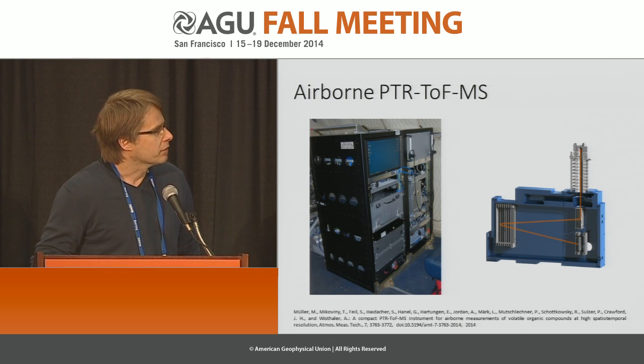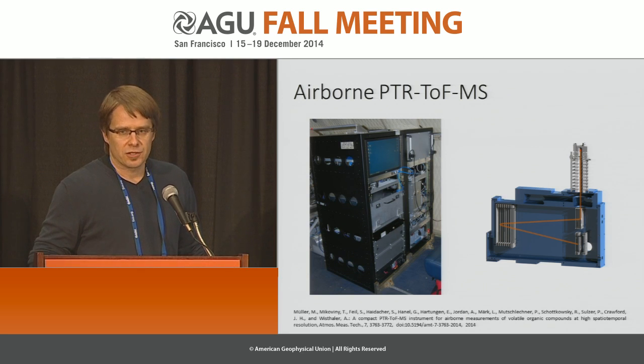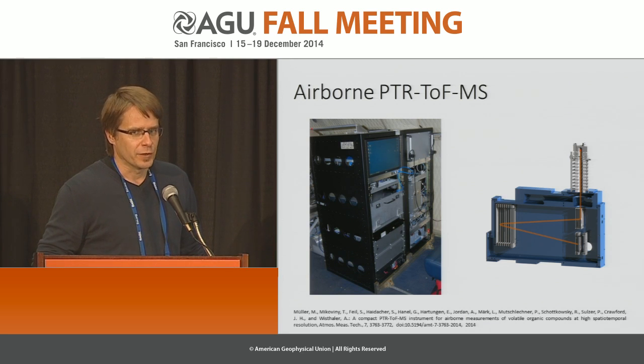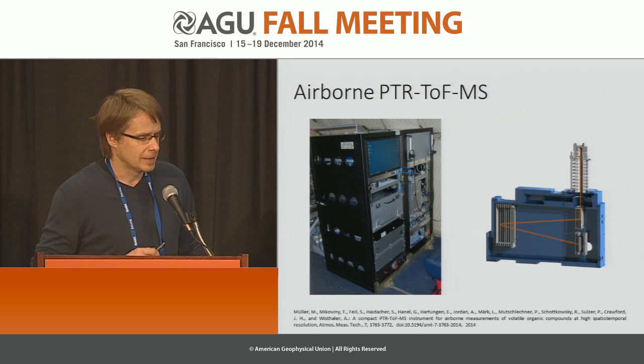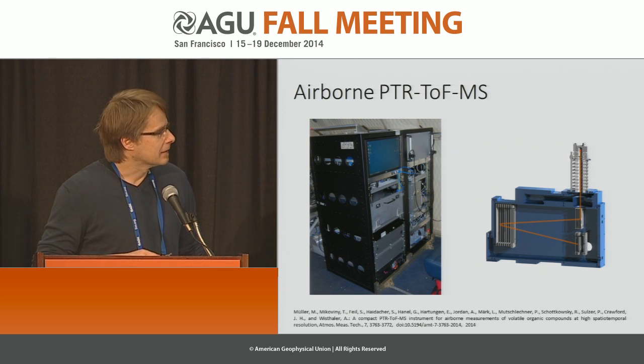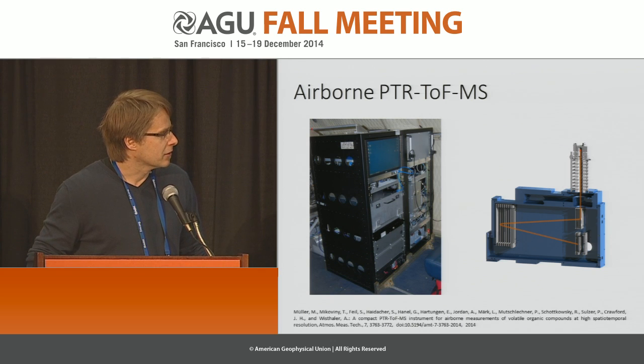So here you see a picture of the instrument. It's not exactly the same instrument Chelsea showed, because that's the high-end and very expensive version. So this is a somehow cheaper version, half price and much smaller. So the flight tube is only 20 centimeters long, and that's why we call it compact PTR-TOF in the literature, although the instrument itself is not compact. And you can find the details on this instrument in a recent publication in AMT.